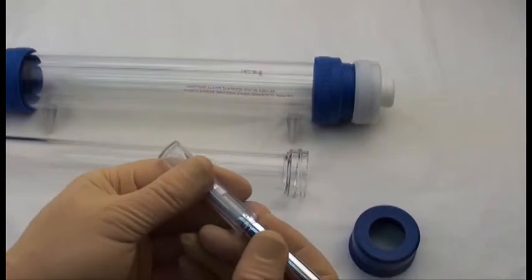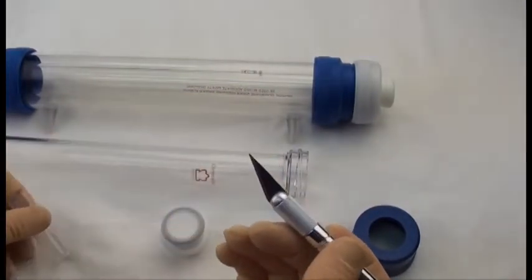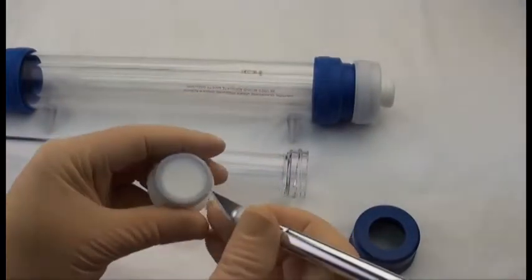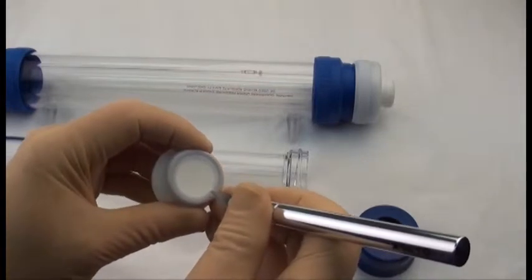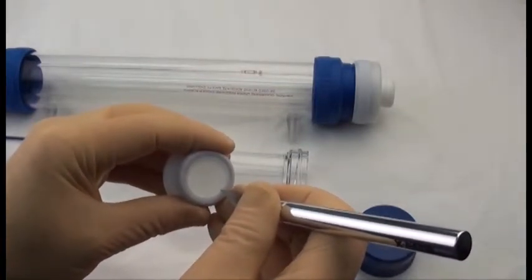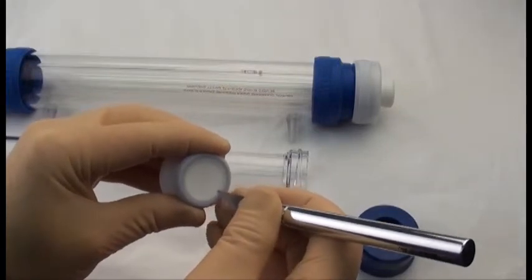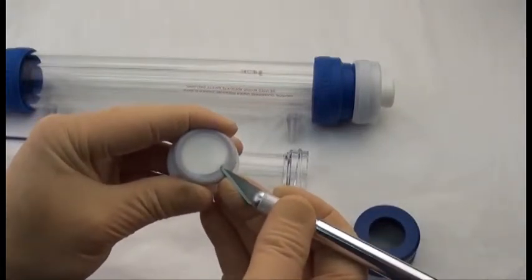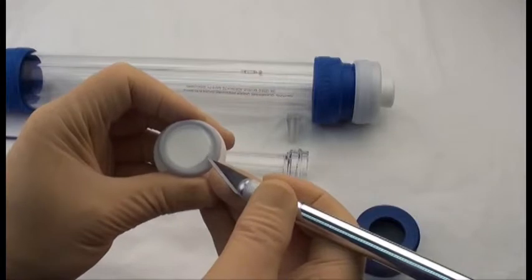So to remove it, take the X-Acto knife and very carefully place it right at the edge of the HDPE bed support, and just pry up the bed support.